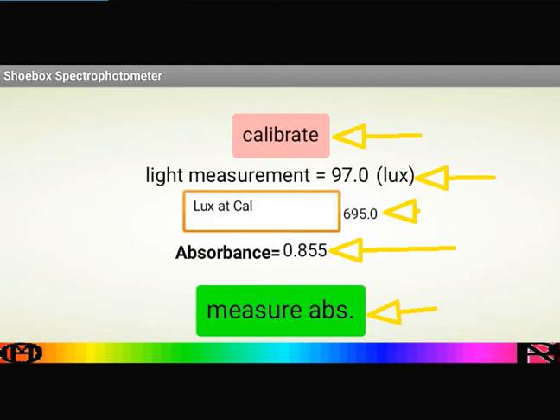There's going to be limitations to this when I tried to measure and make a calibration graph of copper sulfate, which absorbs maximally at 808. And I couldn't get it to work. But at these other shorter wavelengths, it seems to work quite well.